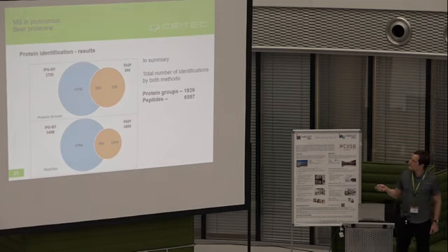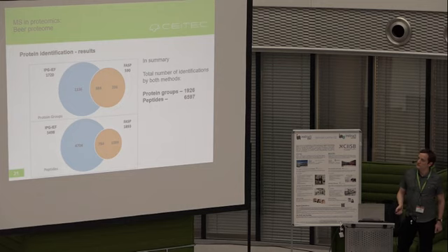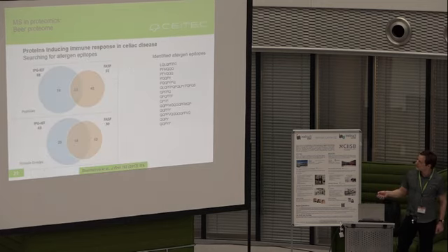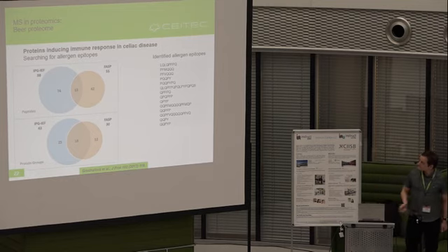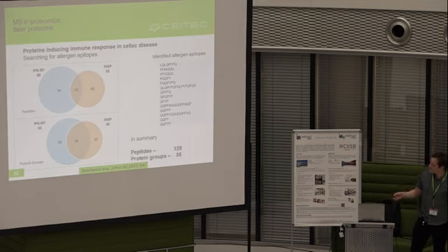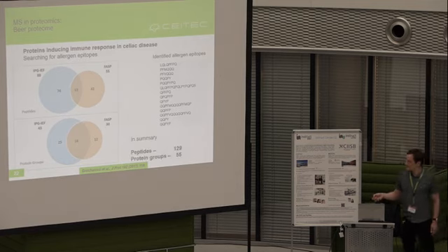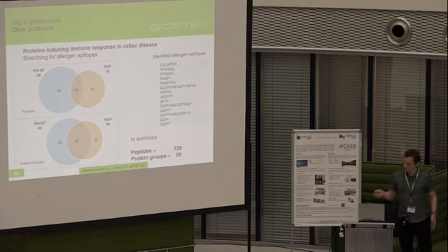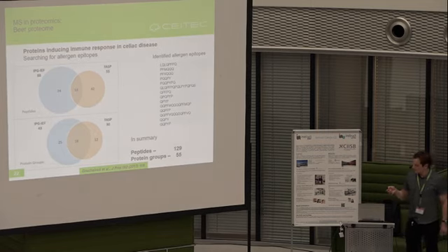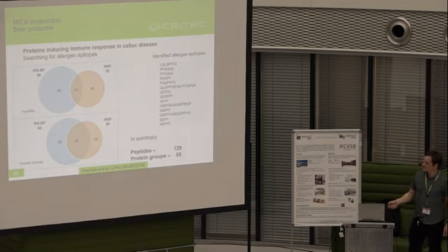In fact, this is not the final result, and every result should undergo some bioinformatic treatment. There is just an example. These are epitopes. These amino acid sequences are responsible for the allergic response of people suffering from celiac disease. And unfortunately for them, you can see that several proteins in beer, about 55 which we detected, contain these epitopes. So the result is obvious. That's the reason why a beer in its crude form cannot be served to people suffering from this disease.